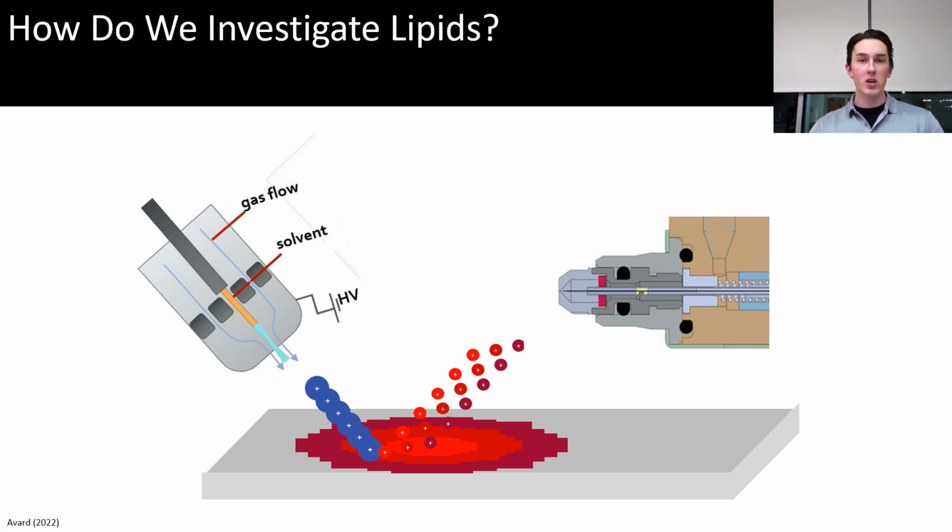This works through spraying a solvent at a sample, forcing ionization that's detected and categorized by the mass to charge ratio, or M/Z. One of the major advantages that mass spec has over other methods is it's high throughput and very accurate in distinguishing different molecules within one sample.